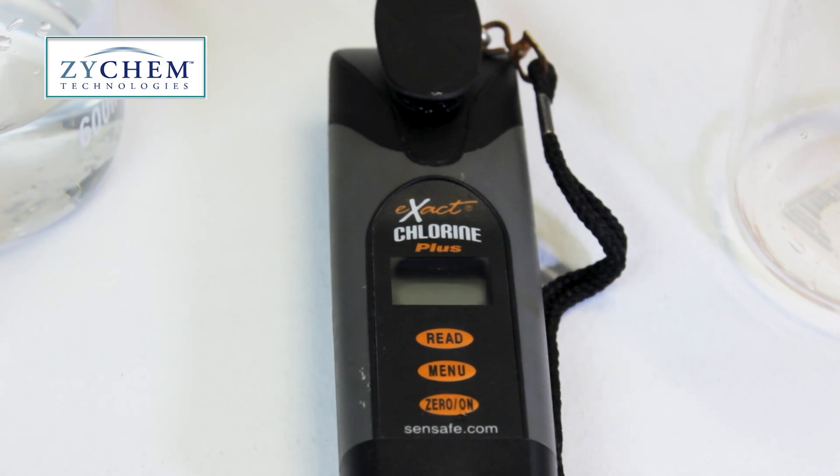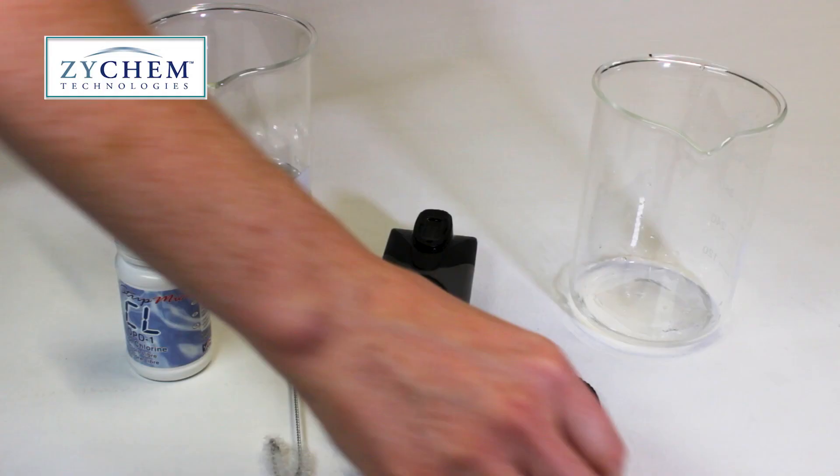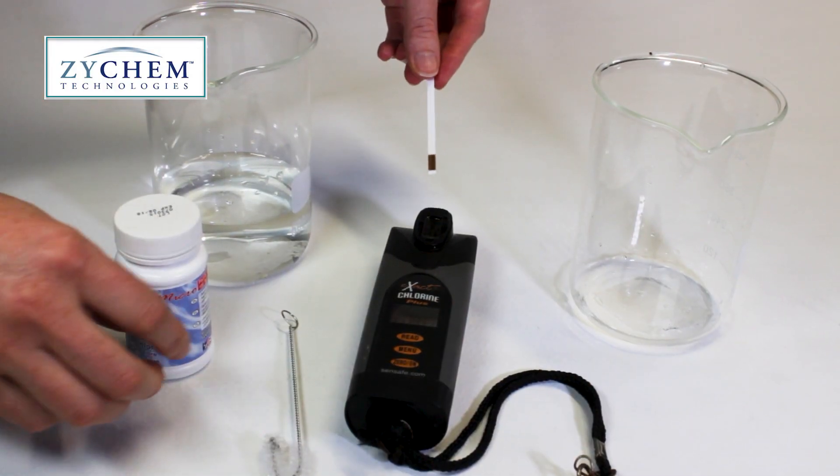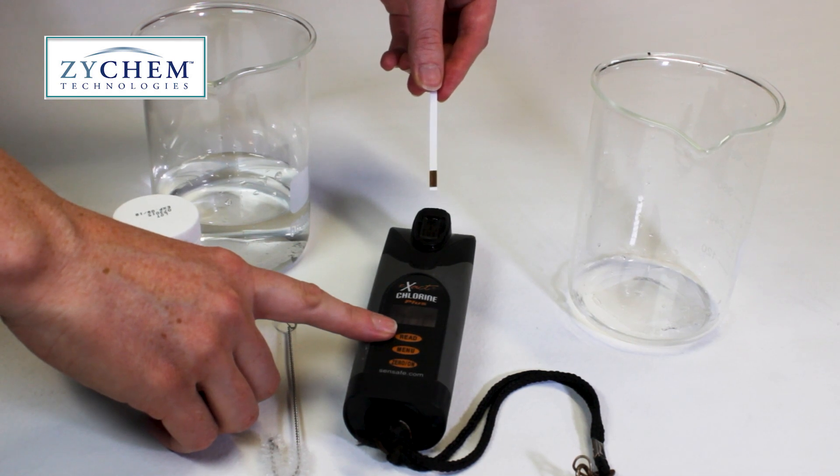Once the monitor is zeroed, take the cap off, pick up the DPD-1 strip, and place it into the cell and push the read button at the same time.